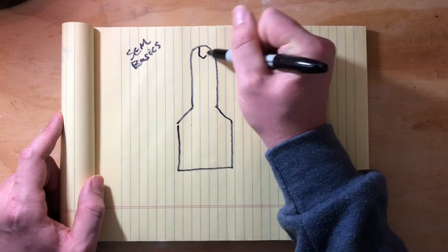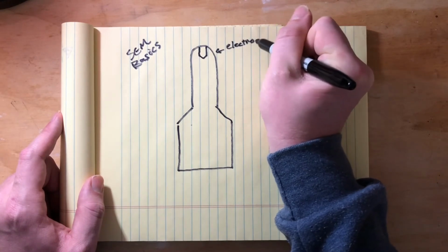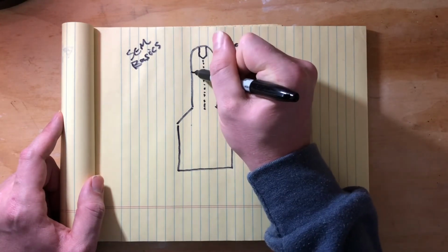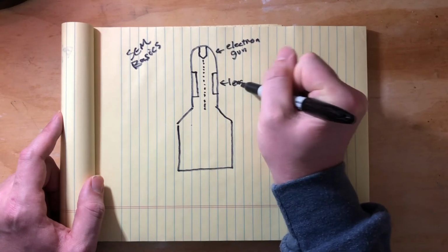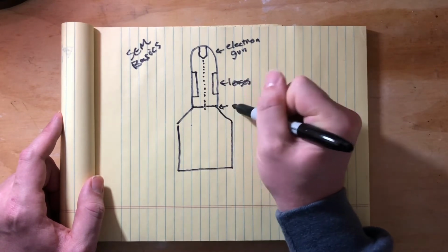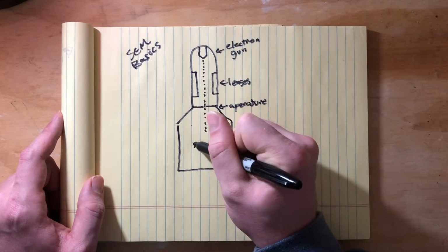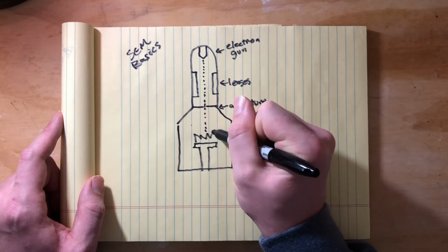And then at the top, there's an electron gun, which generates the electrons that then come down the column, which are focused by a series of electromagnetic lenses. Then they'll go through an aperture and strike your sample.